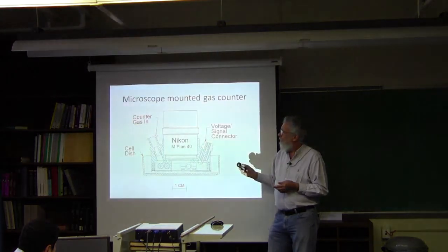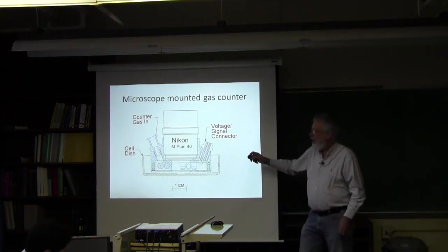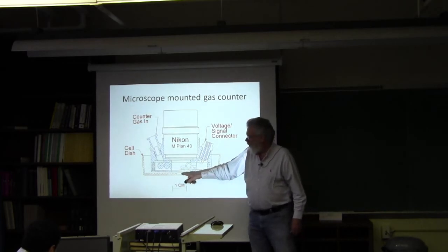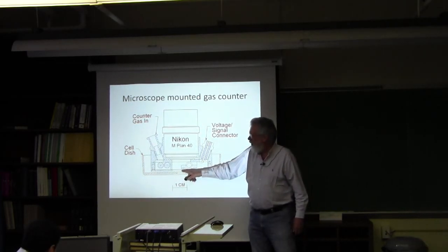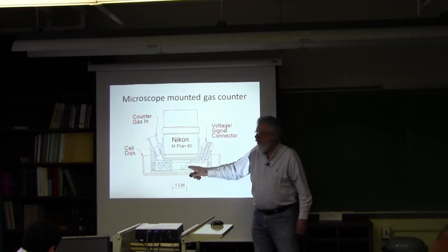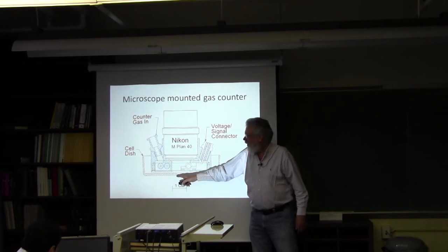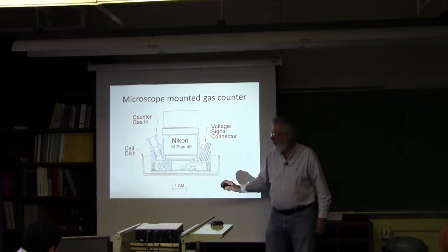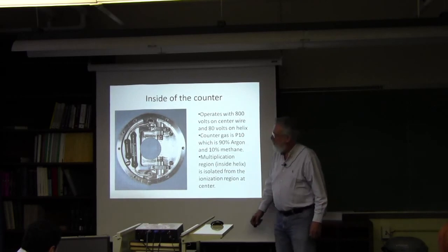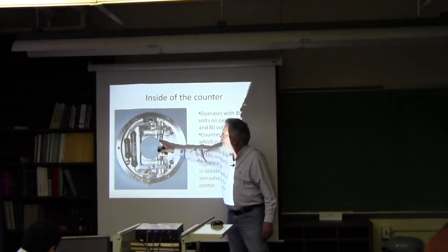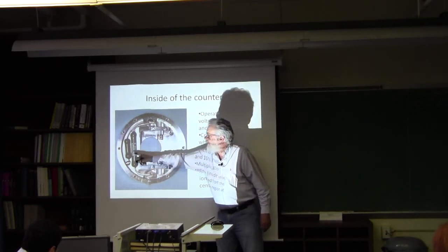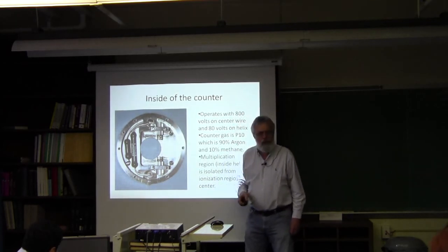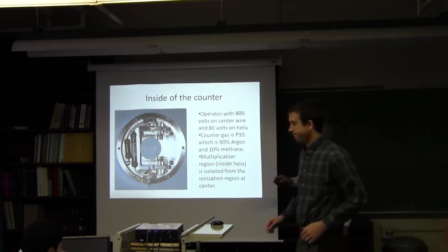Here's the microscope final objective with the gas counter mounted to it. Here's the dish. There's a small space between where the cells are and the entrance to the detector. This is the helix that is the actual detector itself and the center wire. The ions are produced in this region and they drift over, collected by the helix, and then multiply on the center wire. Here's the helix and the center wire of that counter. These two resistors are for setting up the ratio of the fields on the center wire and the helix and allows us to use only a single connection to the counter. We use P10 gas in that.